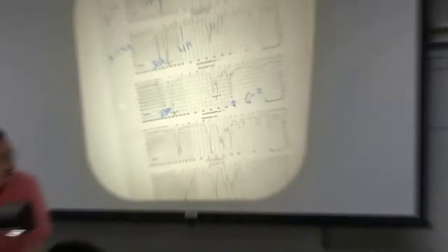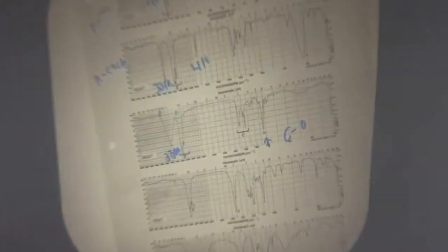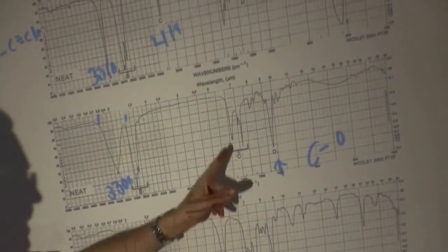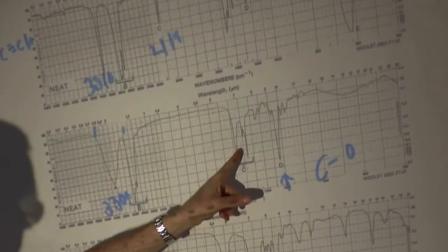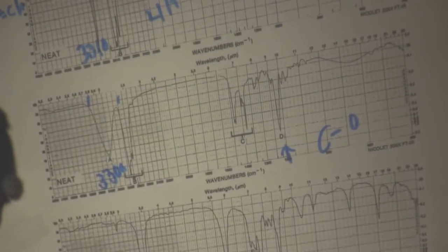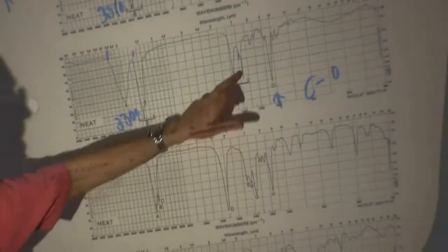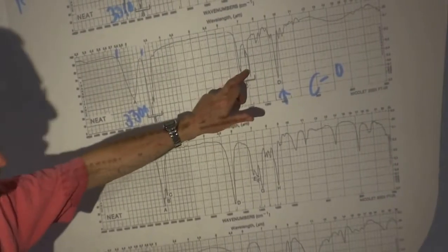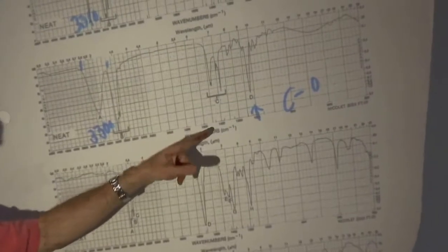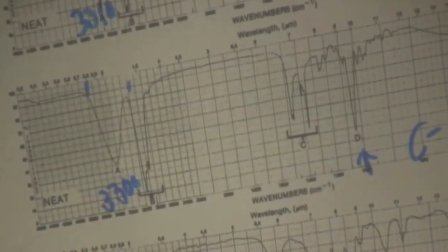What was C? Oh, sorry. What was C? C are a number of, I believe, certainly in this region you have your CH bends. Remember we talked about methylene groups and we said there's one at about 1380 and another at about 1460. So certainly a big part of what you're seeing here, because this is going to be a small chain linear alcohol, are your CH bends there.